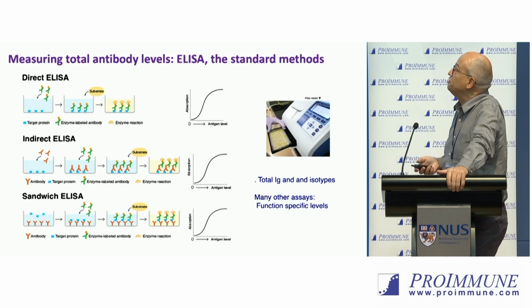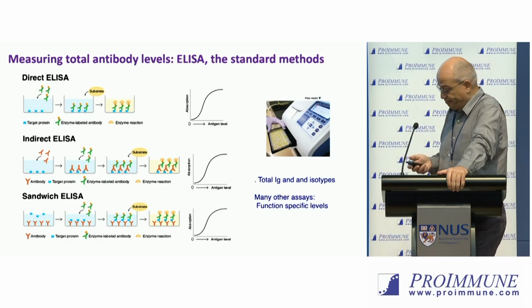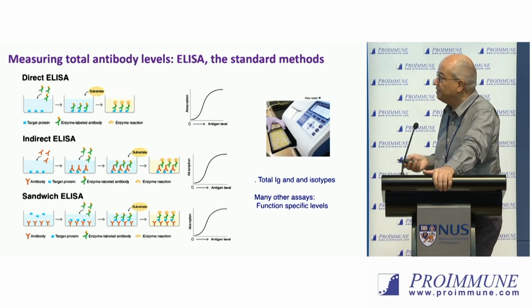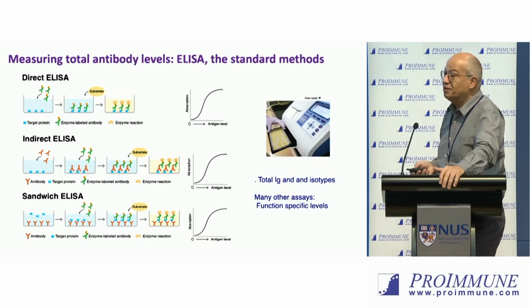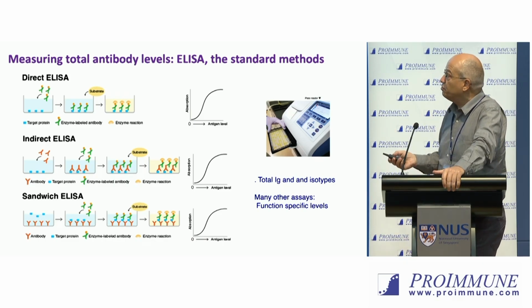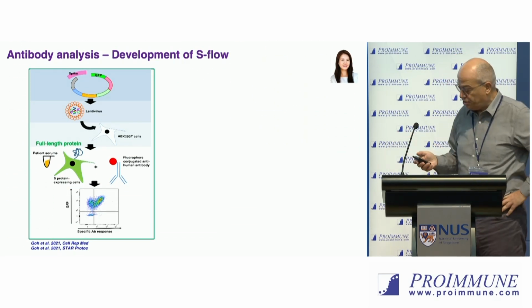I would say the gold standard assay is the ELISA that is used in many labs around the world, and there are many commercial companies selling ELISA for nearly everything. It's good, but sometimes it's a bit long to set up in the lab. You need the antigen and so on. So we decided to take another approach based on cell expression.